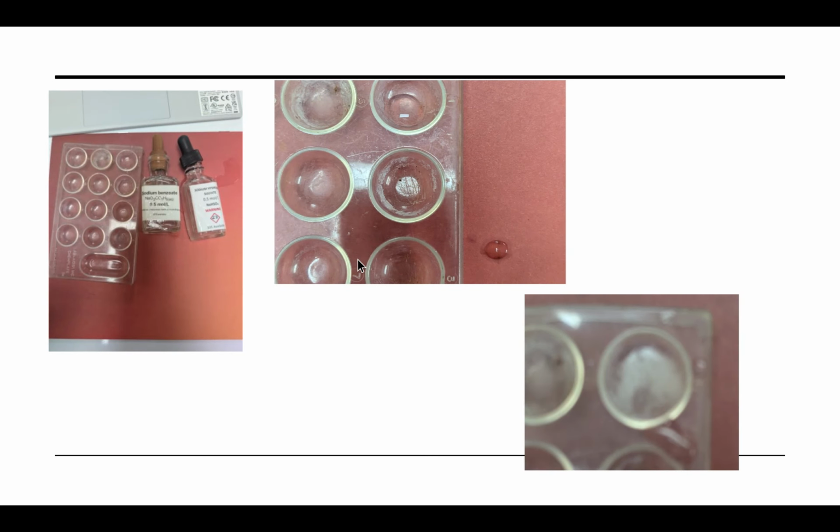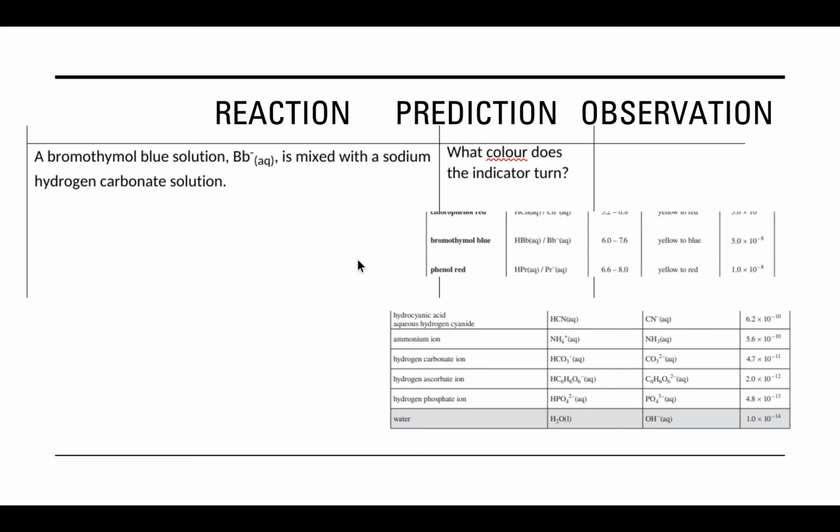So when I came over to this example, I have the two solutions I'm mixing together. I did pick the well plate. I tried to show that each solution was there clear. And then when the two got mixed, and this is just an awful picture, but you do see a solid being formed. And that solid would be that benzoic acid making that precipitate.